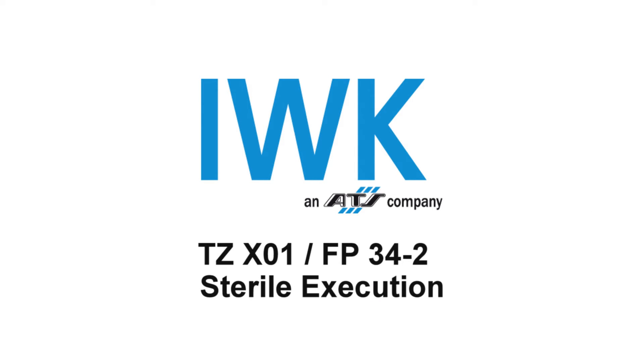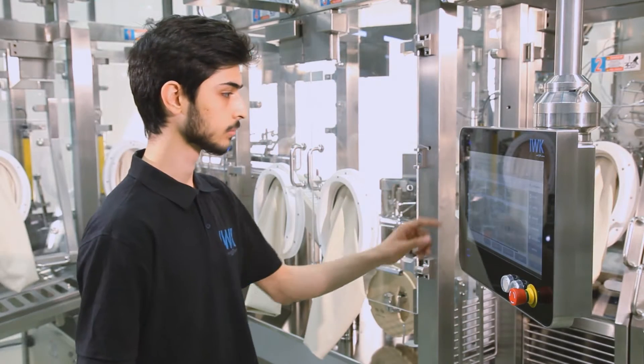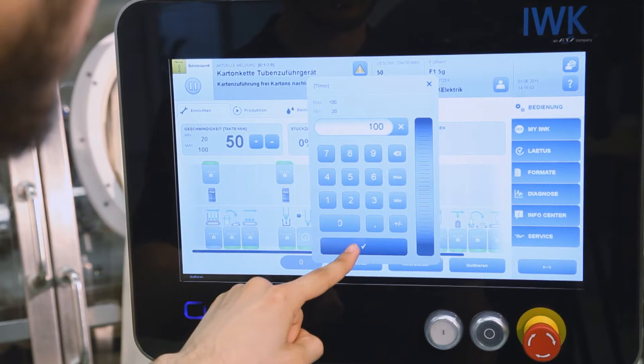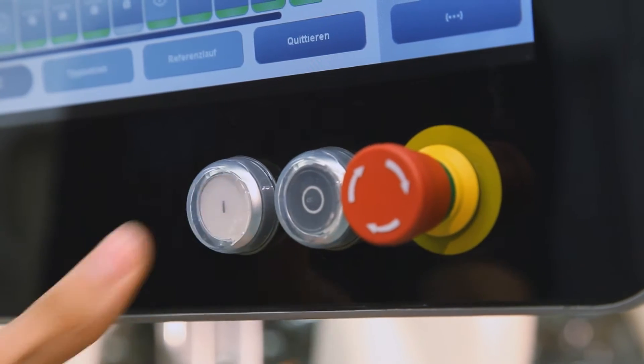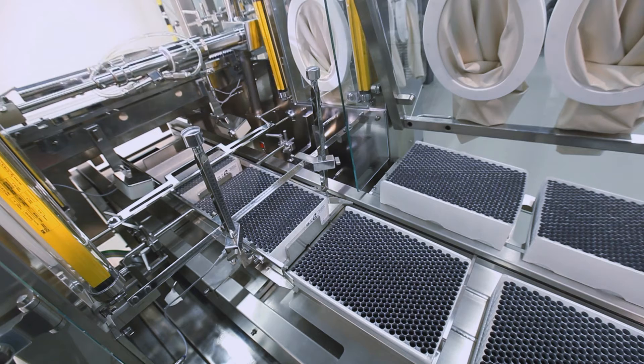IWK Verpackungstechnik GmbH is proud to present the new state-of-the-art sterile tube filling platform FP Doublehead Sterile. The machine is equipped with a special sterile version of the IWK 15.4 inch operator panel, which won the Red Dot Award and the IF Gold Award. The jury of international experts granted the award for the high quality design and user-friendliness of the HMI.